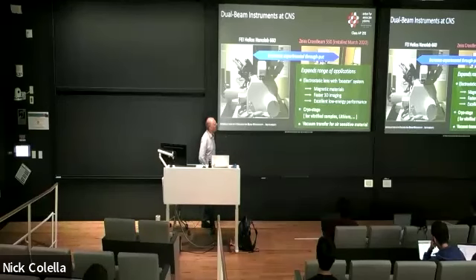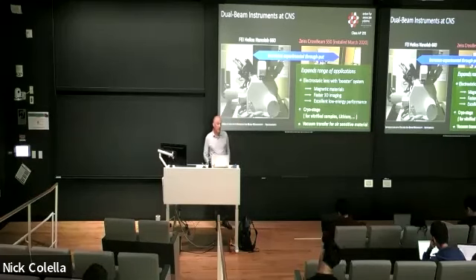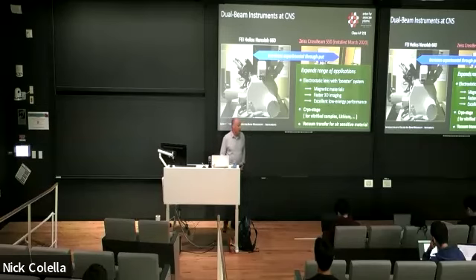And so this has become a more and more important topic in the last couple of years. And so we are building right now all the necessary workflows so that we can work on such air-sensitive materials. A key example are lithium batteries. Because if you work on lithium, you not only need to keep it air-free to omit oxidation, but the material is so sensitive that the gallium beam is actually damaging the material and modifying the structure.